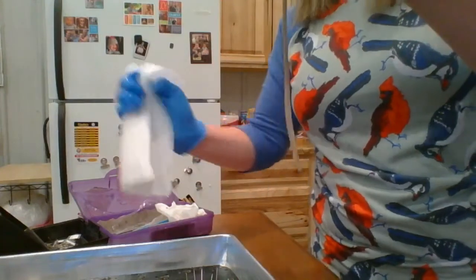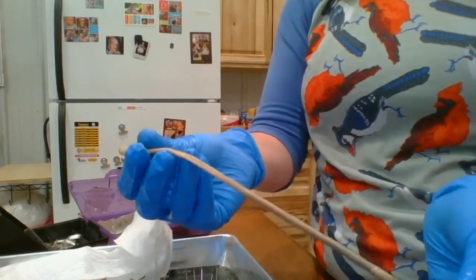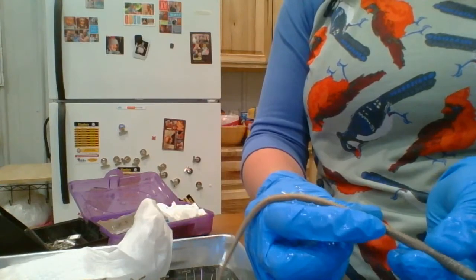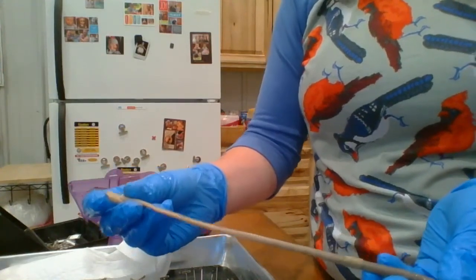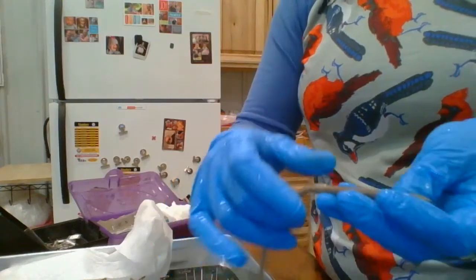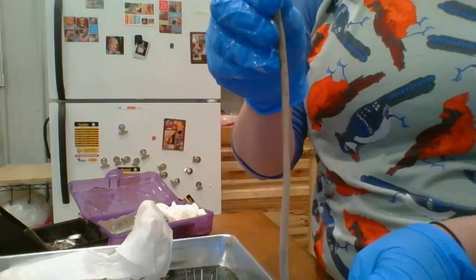Okay, so we have some external features. This worm has a mouth, and I know that this here is the mouth because I can see the clitellum right here, not too far down. And it has the anus. Along the top of it, or along its back, it has the dorsal blood vessel. It also has a ventral blood vessel. The belly of the worm is usually way lighter in color, so here's the ventral side.